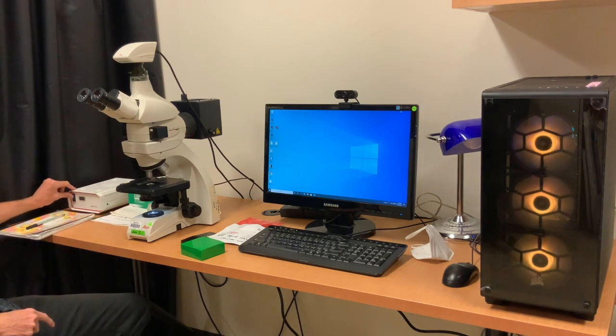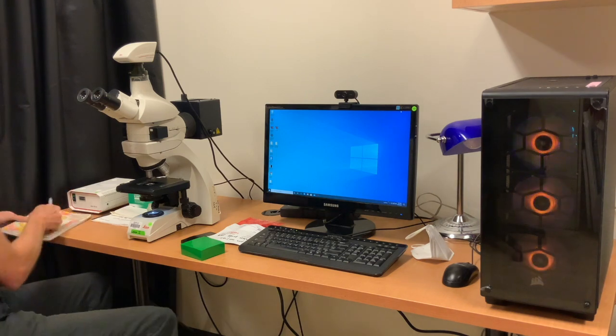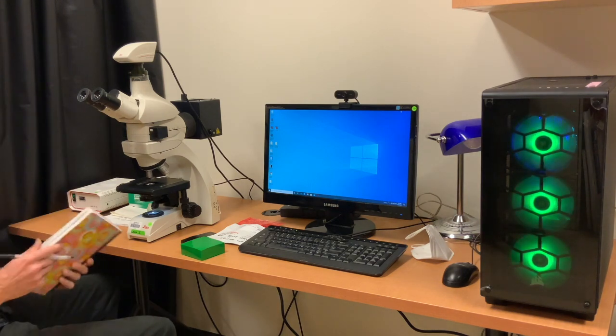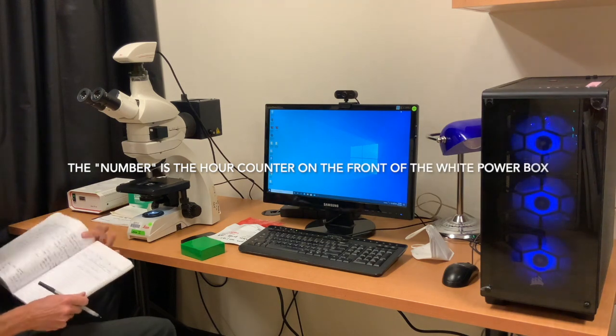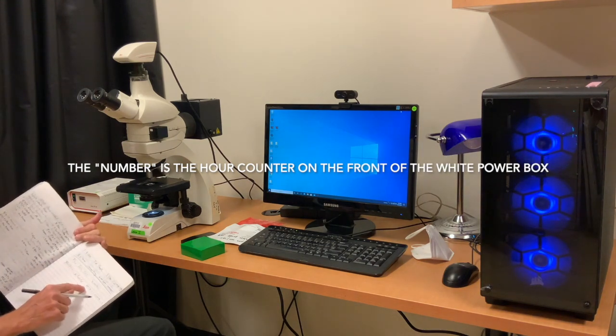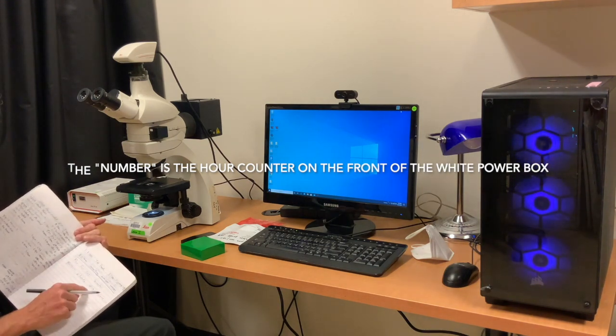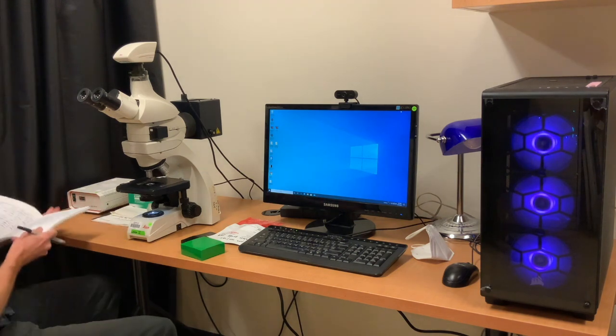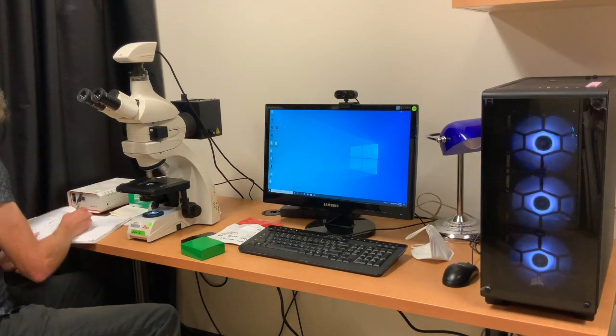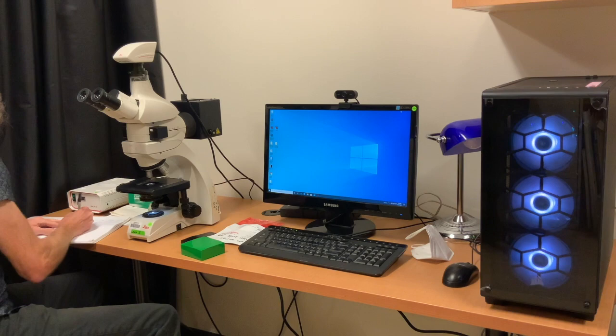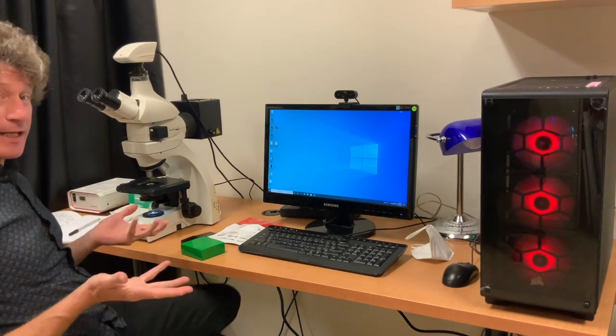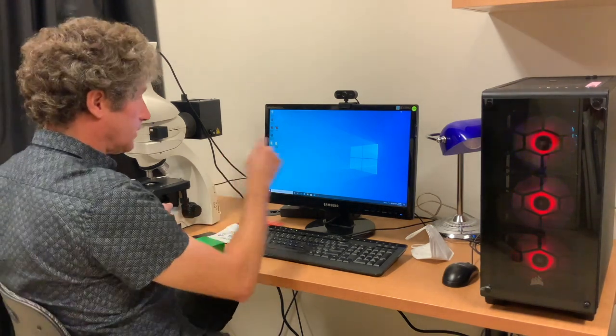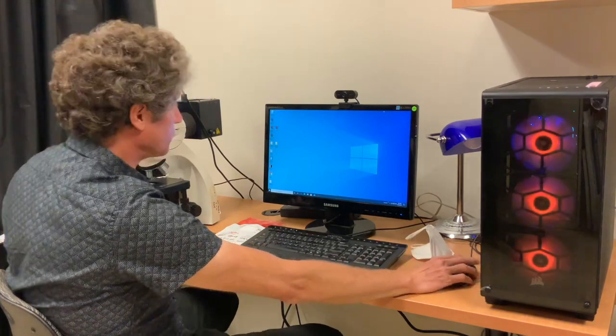The bulb for the fluorescence is right here. I'm going to go ahead and turn on the power. You have to write down in the book the number—your date, your name, and then the numbers here for starting and stopping. That's the layout basics, and then you start LASX software.